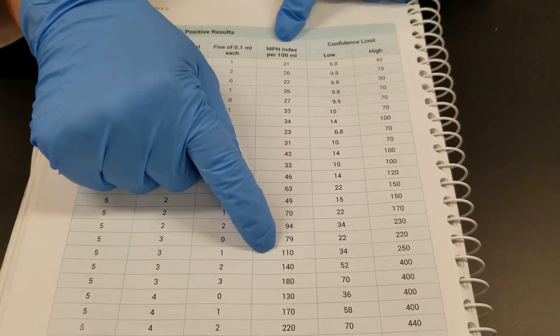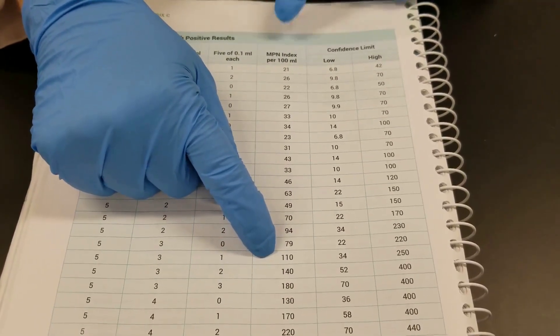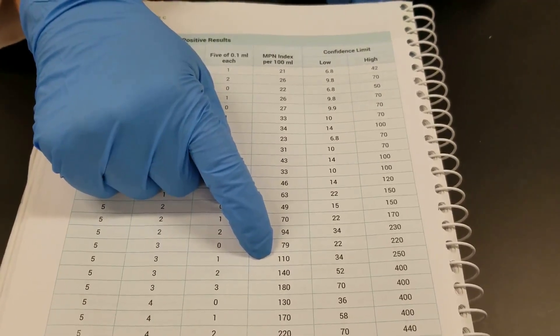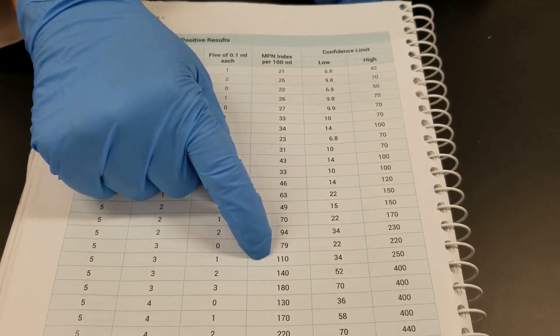That tells you that it's an estimate. That's all it is. It's an estimate that there would be a hundred and ten organisms per hundred mils of water sample.